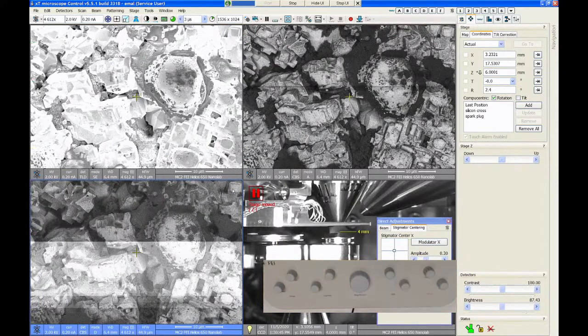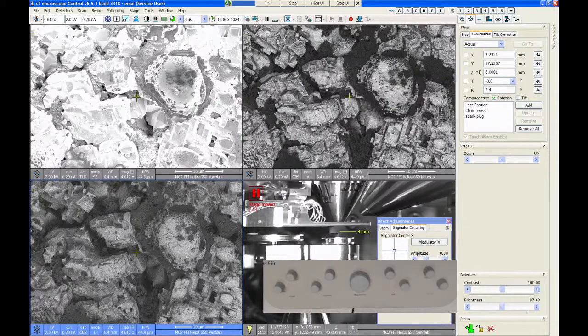And so again, the D-ring is more of a topographic image. You can see more of the structure, whereas the A-ring in the center is much more like a flat image, and you just see the atomic number contrast mainly. So that's the CBS detector.